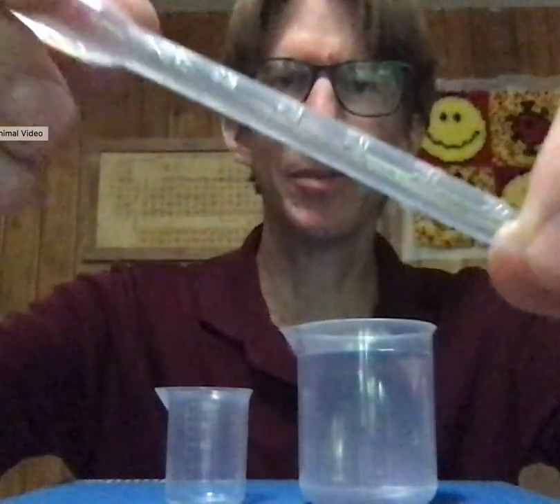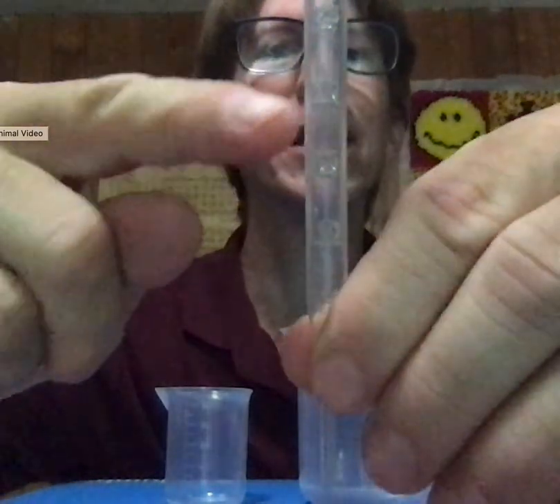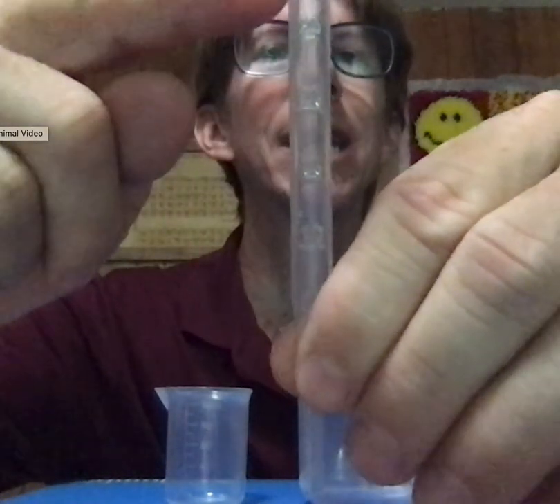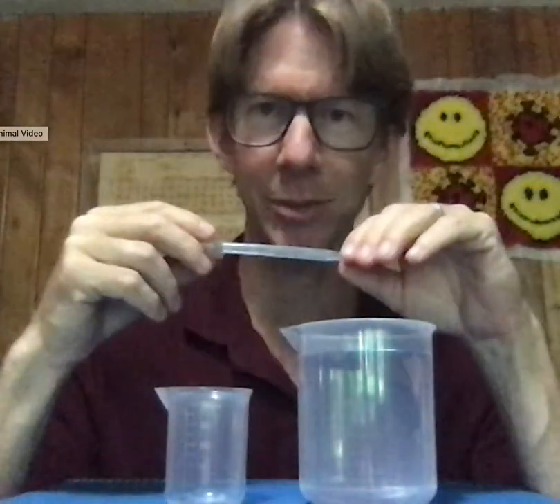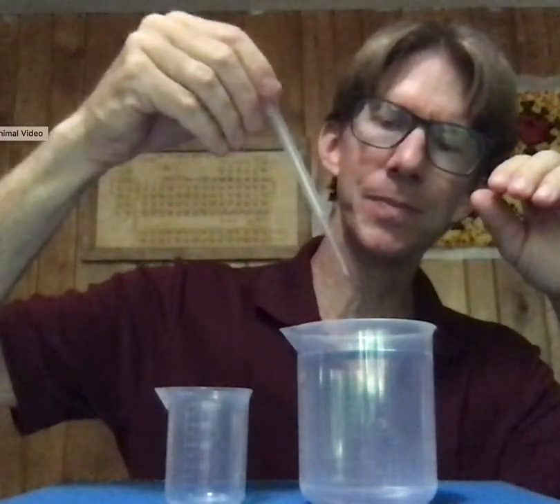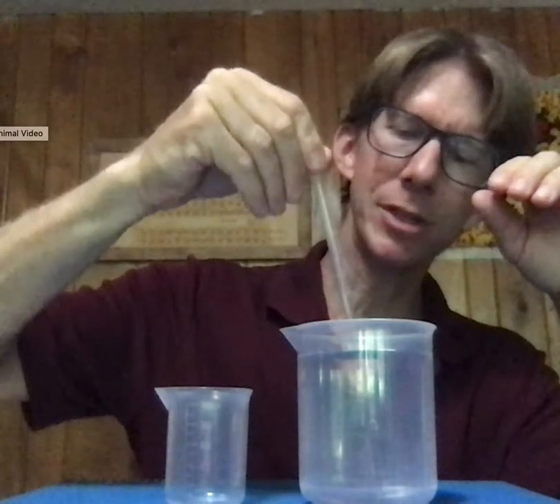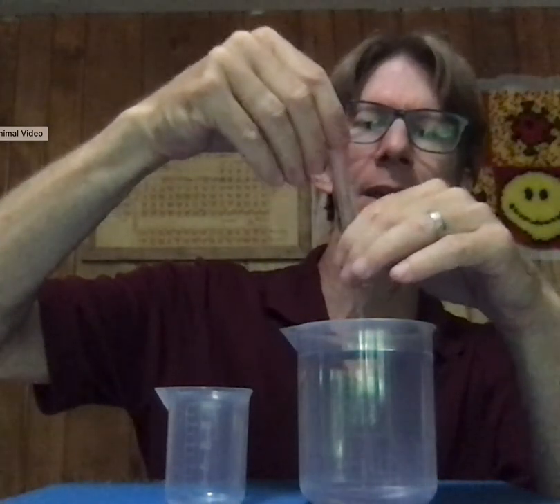If you look at the markings, you can see that there is a 2.0, and at the top it says milliliters are the units. So I've got 2.0 milliliters that I'm going to try and deliver. I'm going to squeeze the bulb, then fill it up to exactly 2.0, which has to face me first. And when I do, you're going to see the shape of the meniscus.